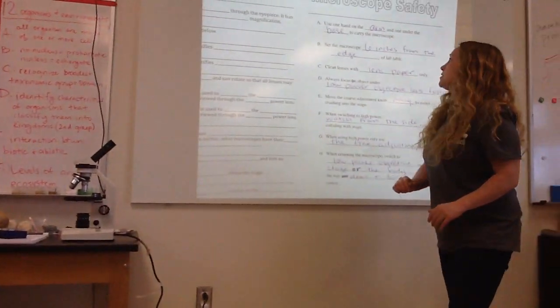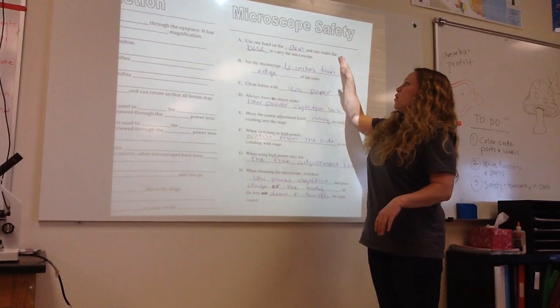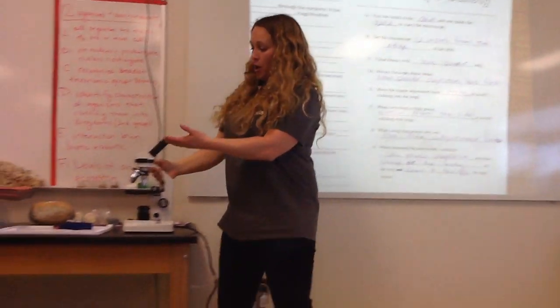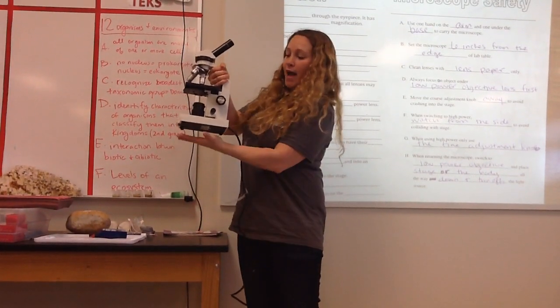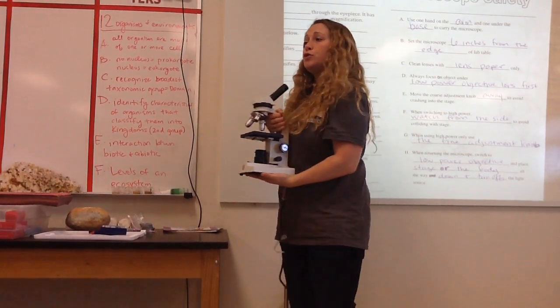So the first thing is, how do you carry the microscope? You use one hand on the arm and one hand on the base, and you always carry it like that. So the arm is this part, and the base is this part. One hand goes on the arm nice and tight. The other hand sits flat, and it sits on top of it. There's one more part. You need to hold it close to your body.